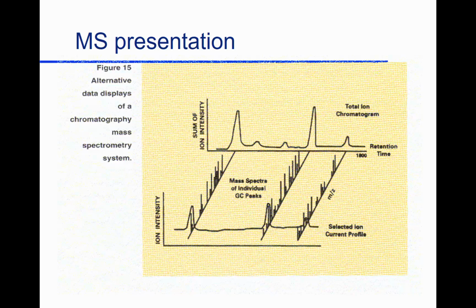Because you're always blowing things apart, you're always forming ions, and you skim off a certain percentage of those ions, and you just measure a certain percentage. Okay, there's more ions, less ions. So you're more or less taking a sampling of it in the mass spectrometer itself. So that's not generated, you're right, by the chromatograph. It's generated by the ions in the mass spectrometer.